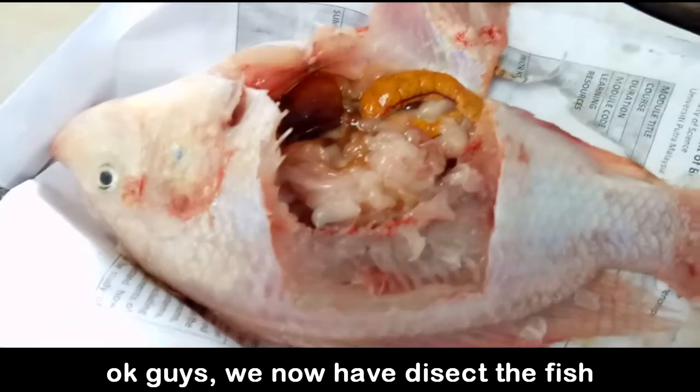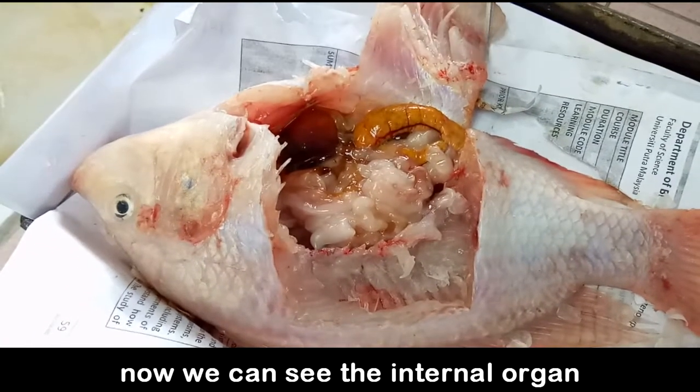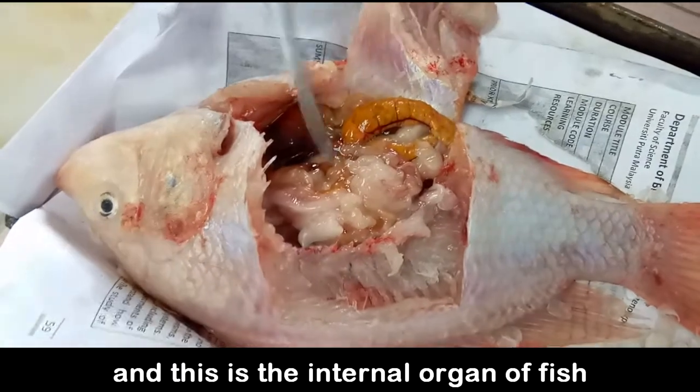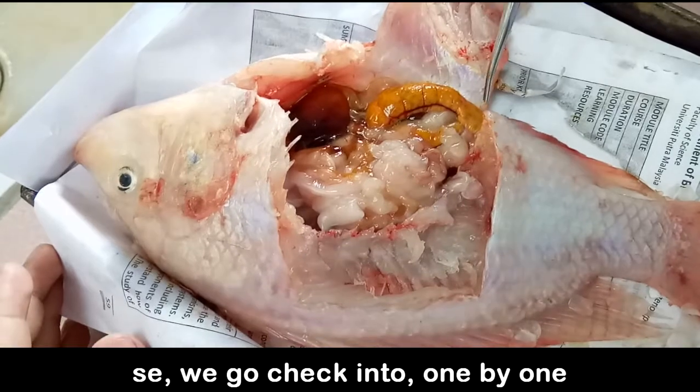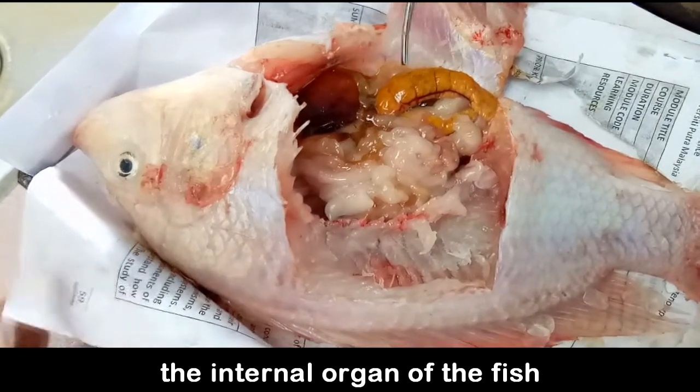We have dissected the fish, and now we can see the internal organs. So this is the internal organs of the fish. So we will check the internal organs of the fish one by one.